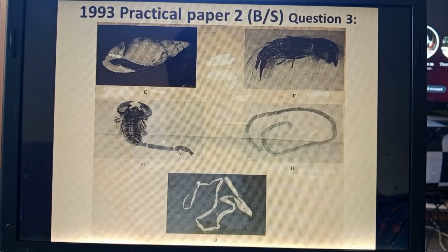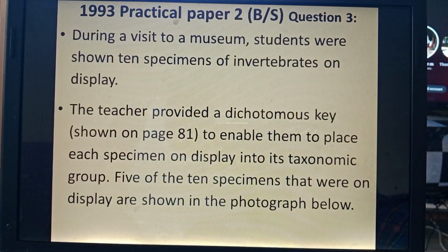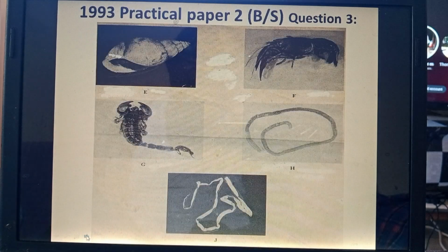So those are the specimens. We have E, F, G, H, and J.